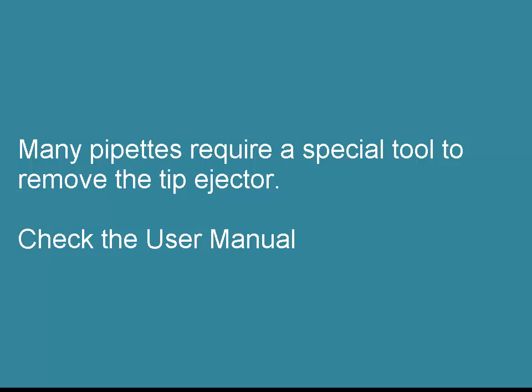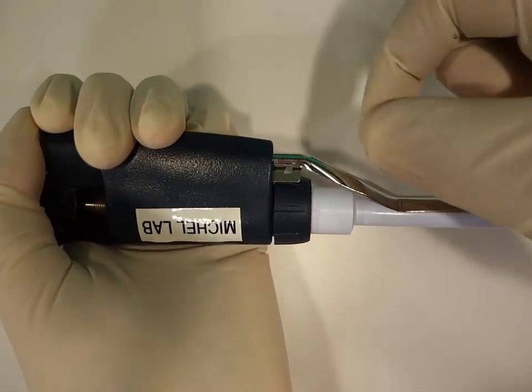Remove the tip ejector. Here are three different types. In this one, you push down the flange and pull off the tip ejector.